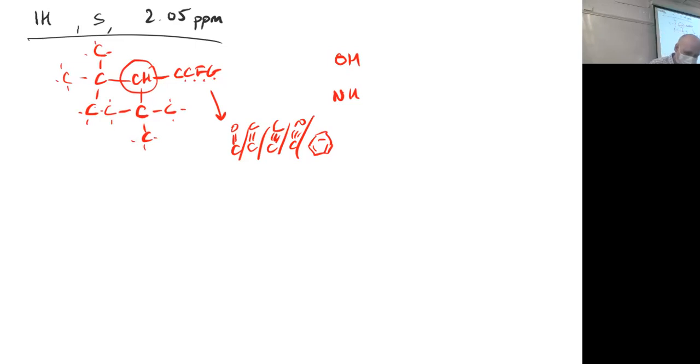Well, you mean on the right side or on all of the sides? On the right side? Okay, so this is possible, okay, I see what you're saying. But I wasn't paying attention to the carbon. It's not actually about this that messes it up. It's these crazy tert-butyl groups that are the only way you would have no hydrogen neighbors. All right, does that make sense? So you did, congratulations, figure out a way to have this work for a CH, but it's pretty unlikely that these 1H singlets represent a CH.